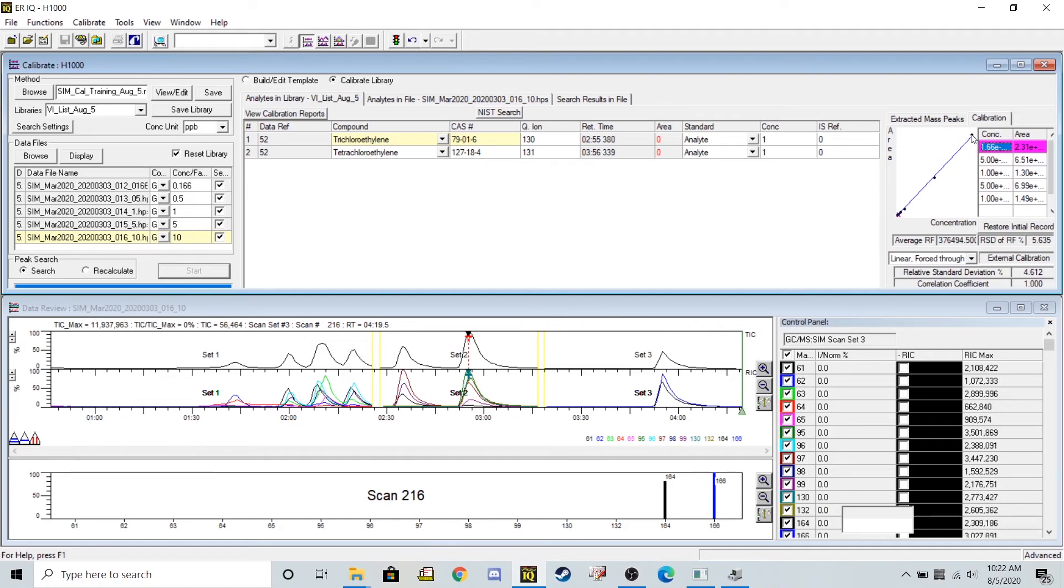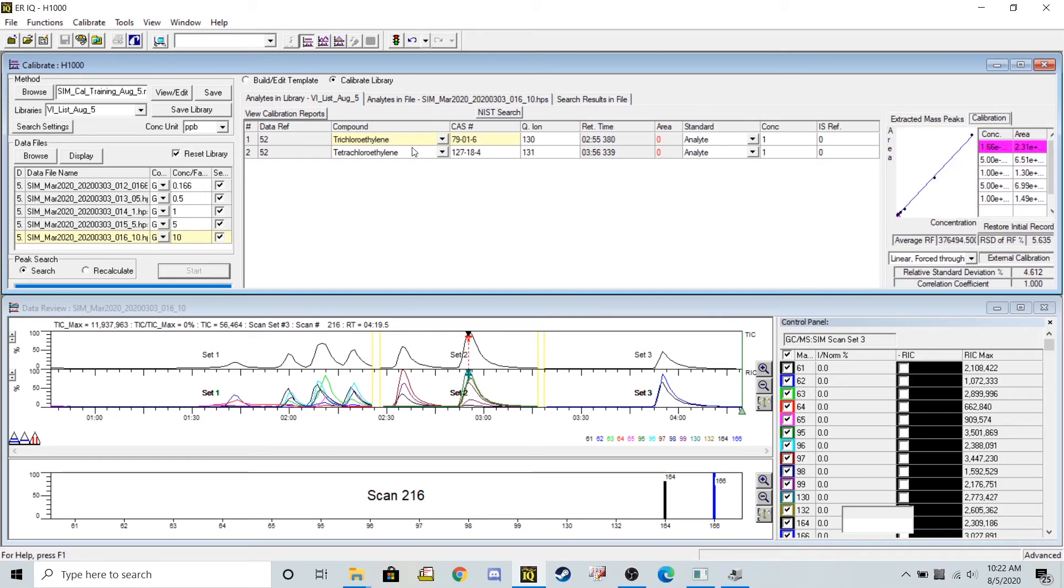And these dots need to be as close as possible to this line. That's going to indicate a low standard deviation. We see that over here at 4.6. But we don't have this same nice calibration curve for our tetrachloroethylene.